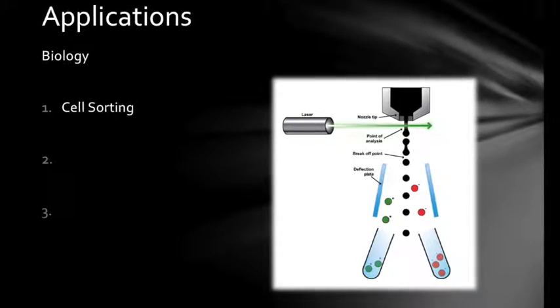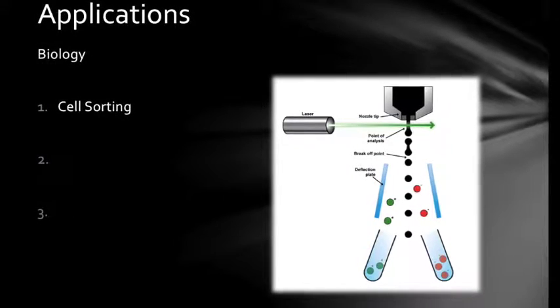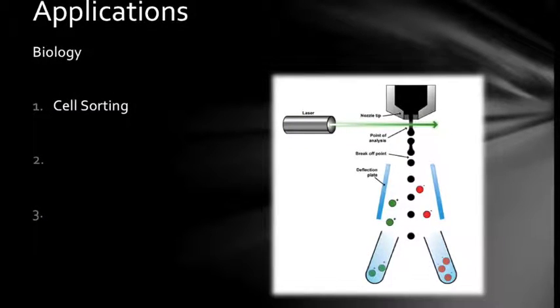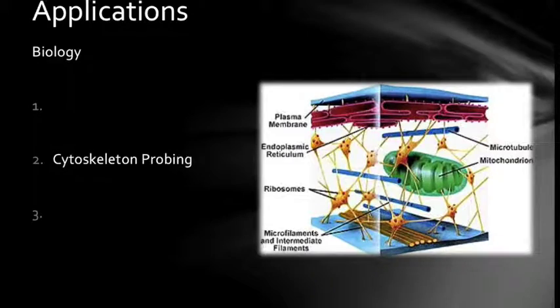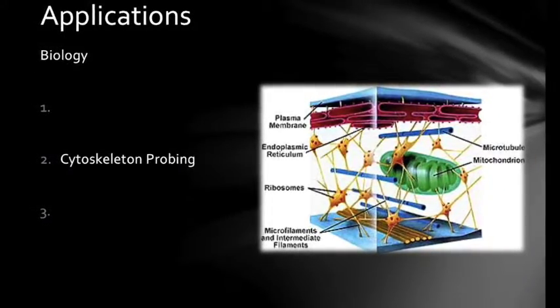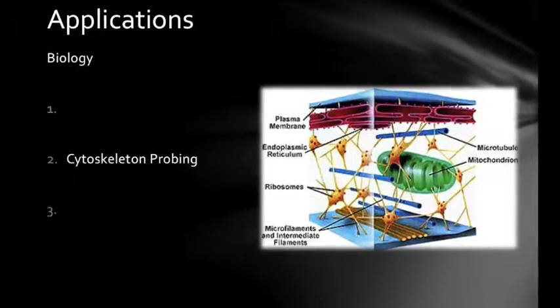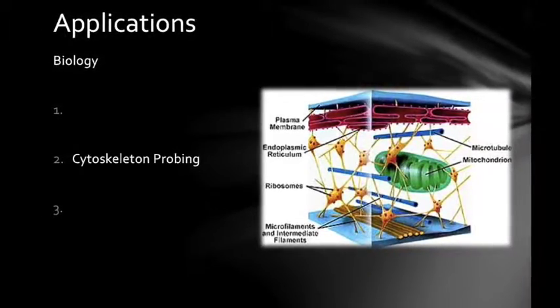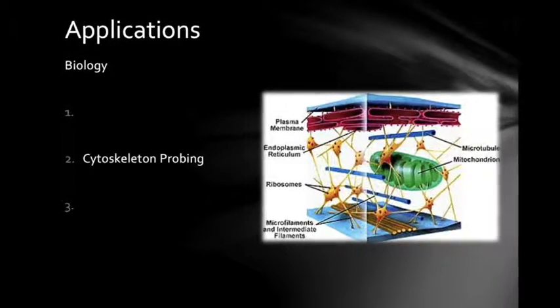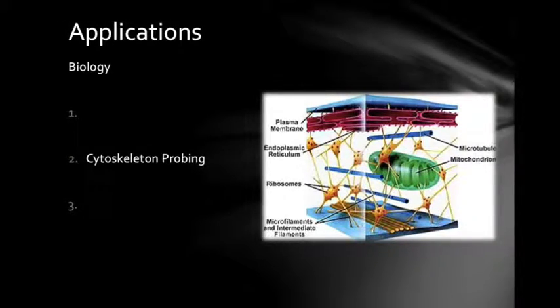This design is based on dynamic fluid patterns and dynamic light patterns in which single and multiple layer traps are employed for cell transportation and recognition. The optical tweezers technology is also used with the actin cytoskeleton model to probe the distinct underlying remodeling mechanism. This allows scientists to quantitatively study how cell mechanical behavior is associated with alterations in the cell functions.